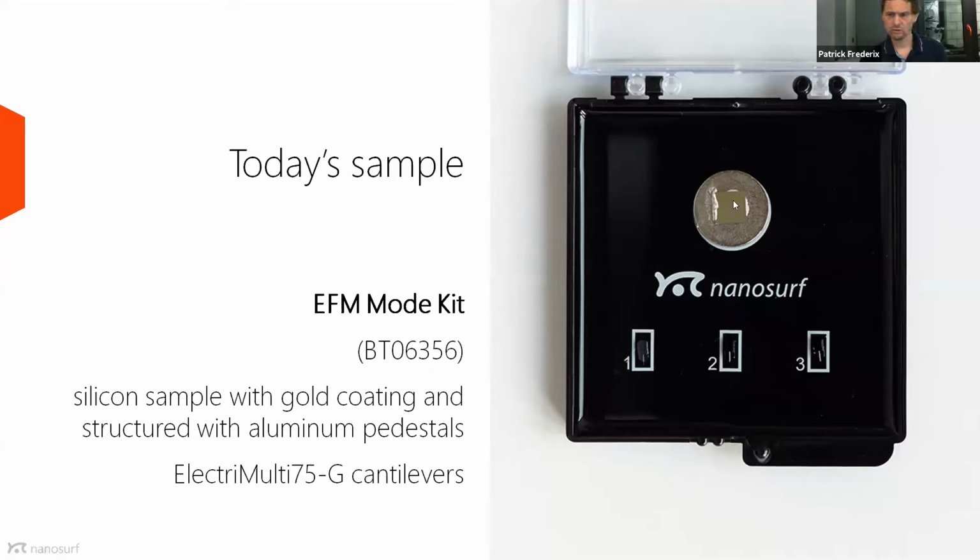The sample has a gold coating, and on this gold coating, there are aluminum pedestals, and these two materials have a different work function. So we do expect to get different tip contact potential difference when scanning either on the gold or on the aluminum. Cantilevers in the mode kit, and the one that I'm also using today, is Electri Multi 75 or Multi E75. Cantilevers from BudgetSensors have a resonance frequency around 75 kilohertz, and they are suitable to do this kind of experiments.